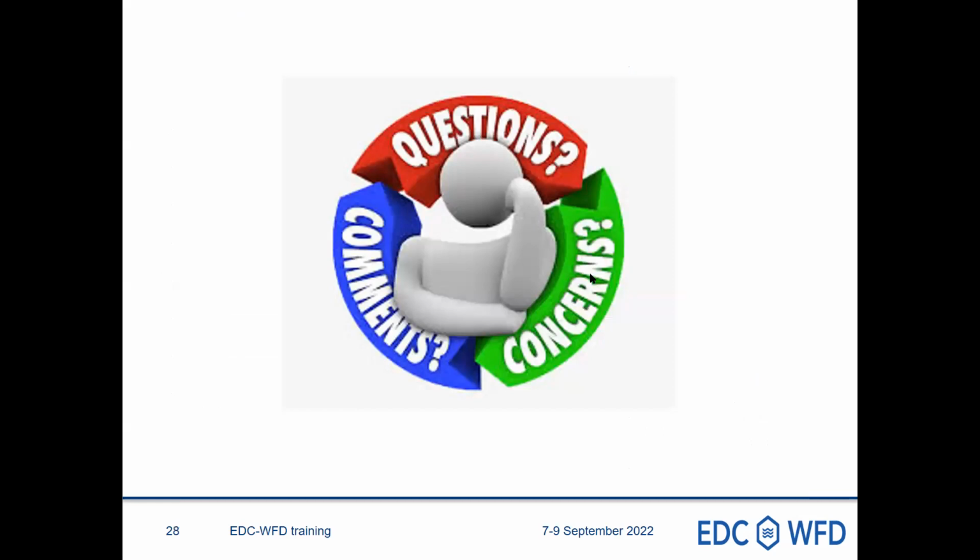Do you have questions or experience to share with this issue of how to validate a method when you do not find a real blank matrix representative of your intended scope? How do you solve it? Did you have experience on that?